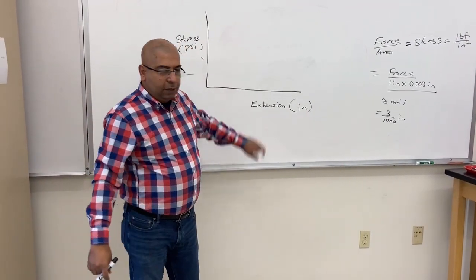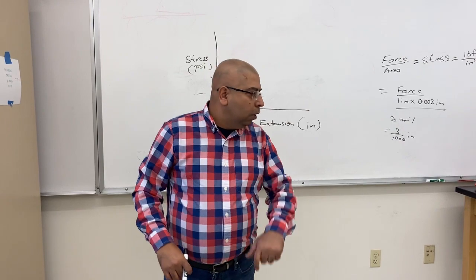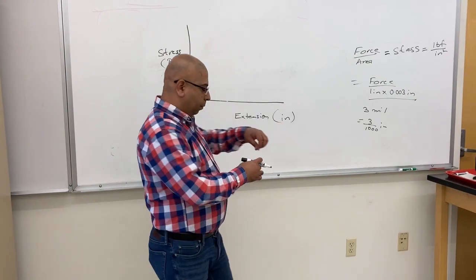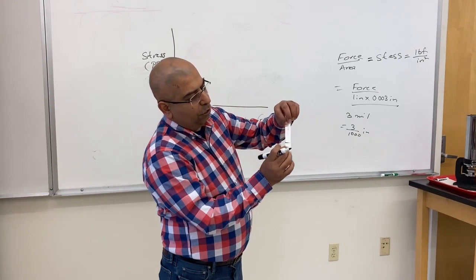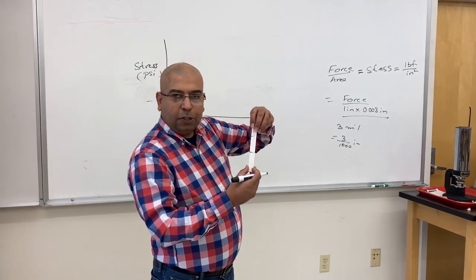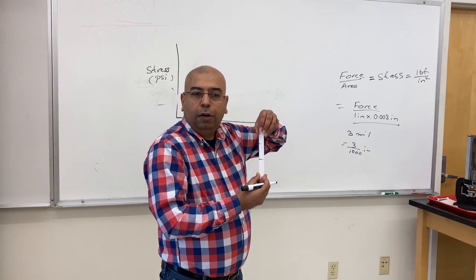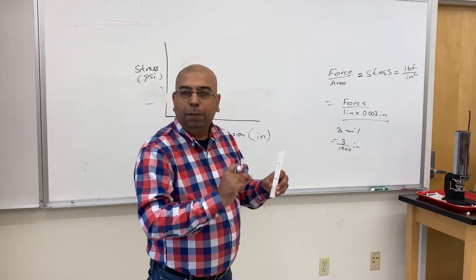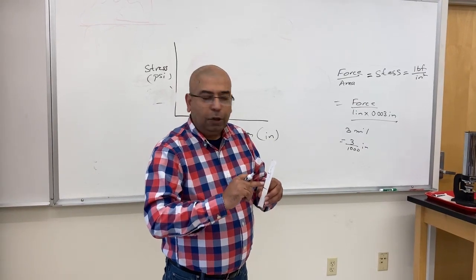And our x-axis, here we are talking about extension, right? But think like I am stretching a sample which is 2 inch wide, and I'm measuring how much it is stretching, versus I start stretching a sample 5 inch wide. The stretch behavior of the material can also change with how long a specimen I'm testing. So we have to also normalize for what we are stretching.